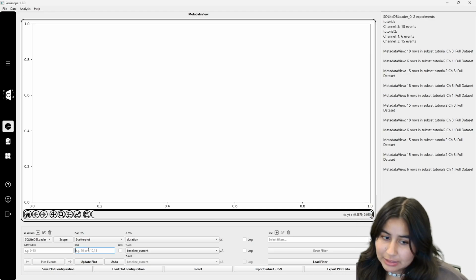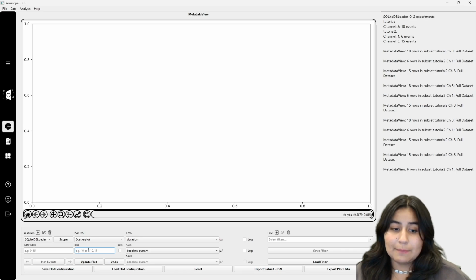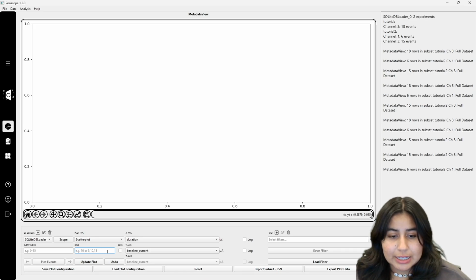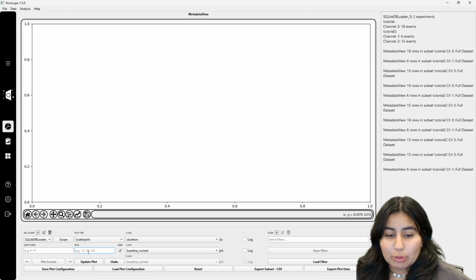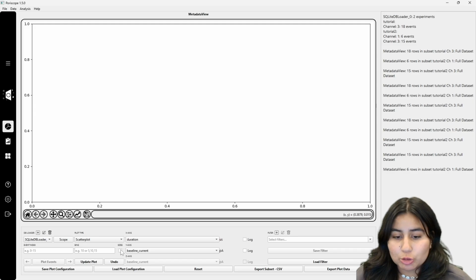And in that flexibility, you can even add bins. For instance, you can enter how many bins you'd like, or you can also check the sizes spots and enter the sizes for bins. So if you enter 1.2, 3.5, that's 2 bins. The first one is that size, the second one is that size. So just something cool to be aware of. You can also choose to enable the log scale, depending on whether that's useful for you or not.